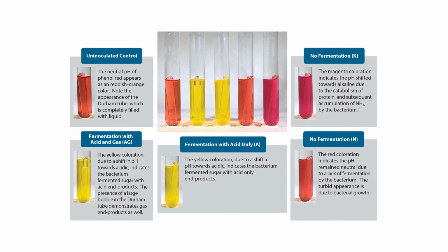Phenol red broth is a convenient way to separate members of the gram-negative enteric family, which often differ based on their ability to ferment lactose.